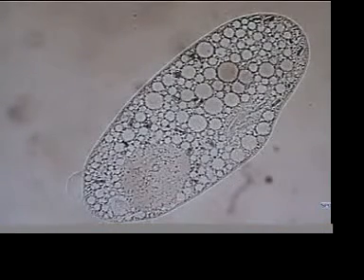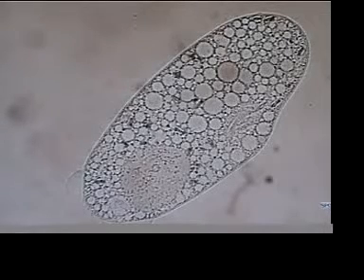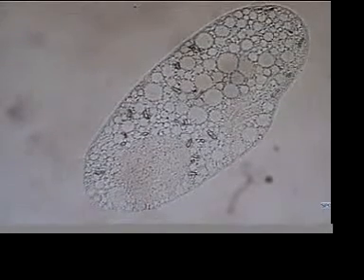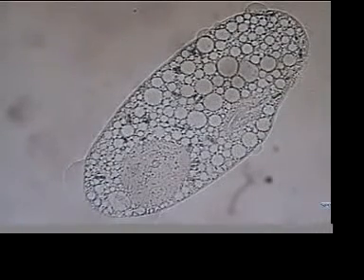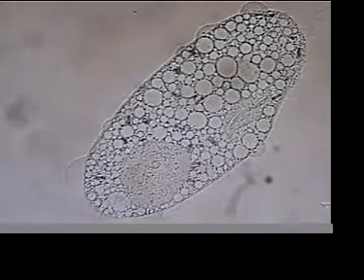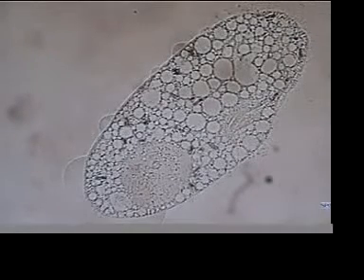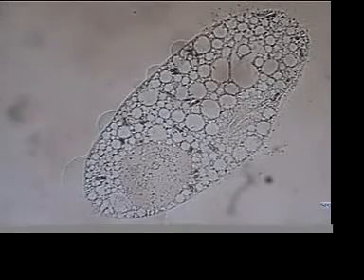This is a paramecium, and if you look carefully, you'll see there's some blisters in the bottom. Let me move them up just a little bit so you can see that. Another two more new blisters just formed on top. Here, and here's two blisters, and something just broke here. Oh, I believe he just exploded. There's material being vented, probably from the underside.